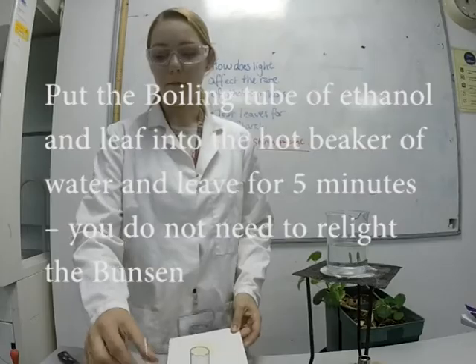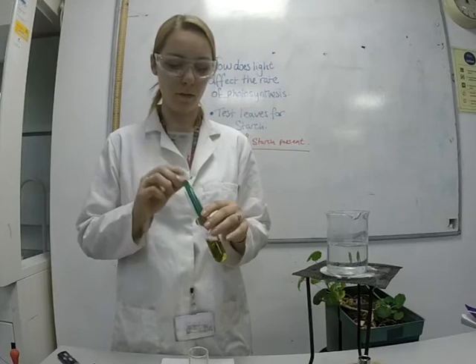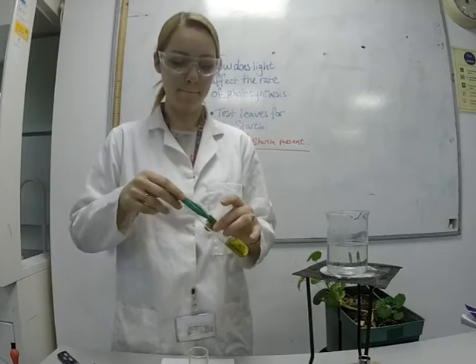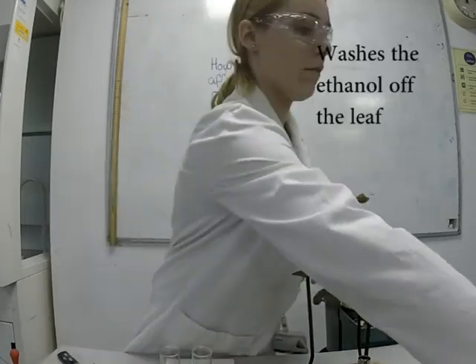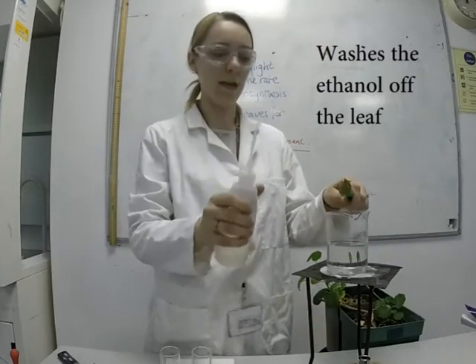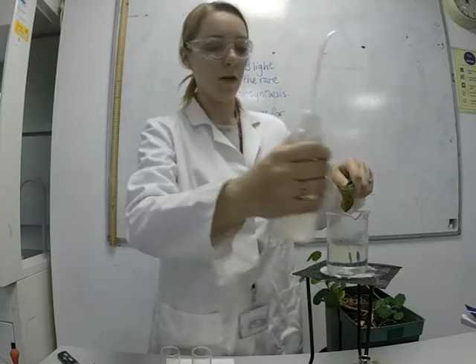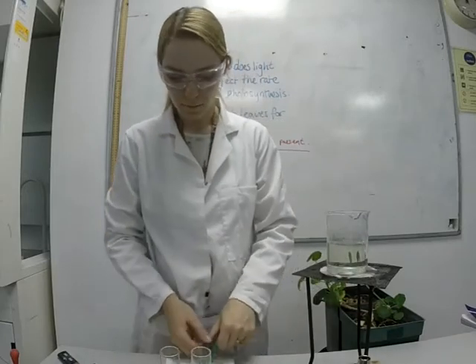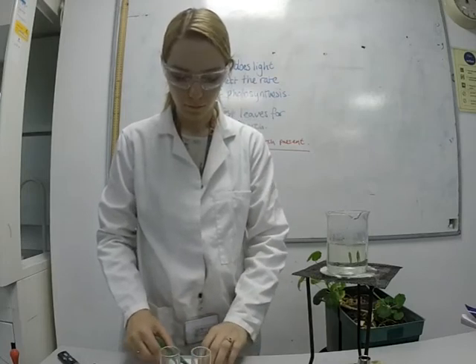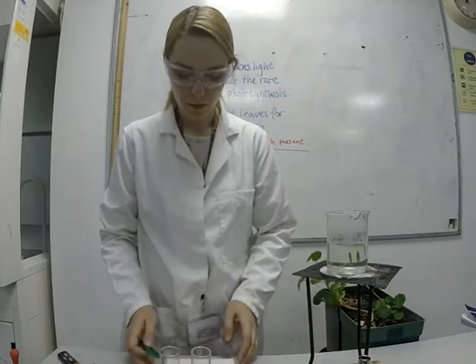Swirl the leaf around in the ethanol and leave it there for five minutes. After five minutes, take your leaf out of the ethanol and rinse it in some distilled water to remove the extra ethanol. This should soften the leaf up as well. Then lay your leaf flat onto a white tile.